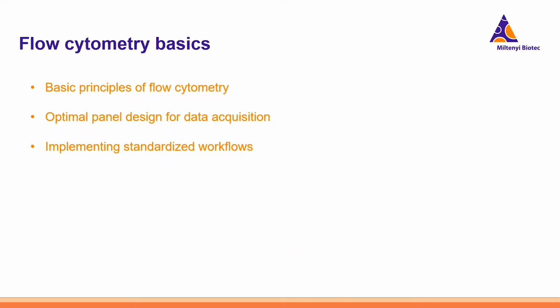So today we're going to go over basic principles of flow cytometry, optimal panel design for data acquisition, and then how you can implement standardized workflows with your flow cytometry experiments.